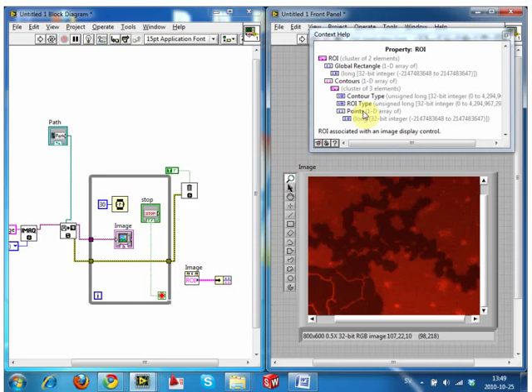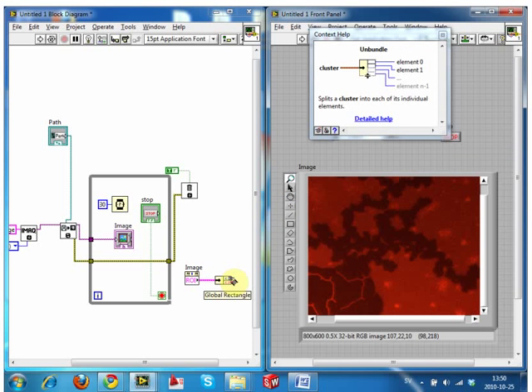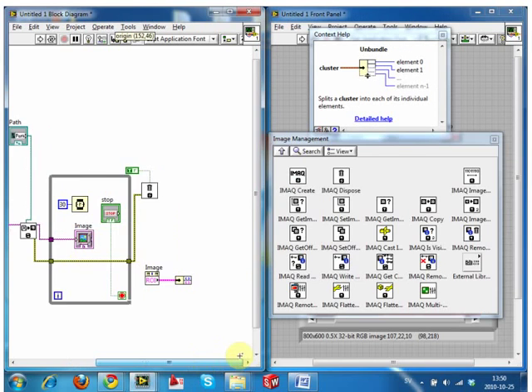I mean, they're all in there. It's just, for this example, you don't need them. The only thing we need is this box that we're drawing. Okay, so we have this global rectangle. And like just from the first example, we need to change it to a different format. So what we're going to do first of all is drop on the light bulb so that we know where we're at. We're actually running out of time here. Let's do that first then.